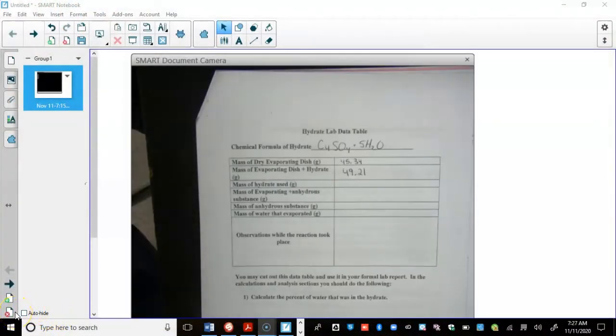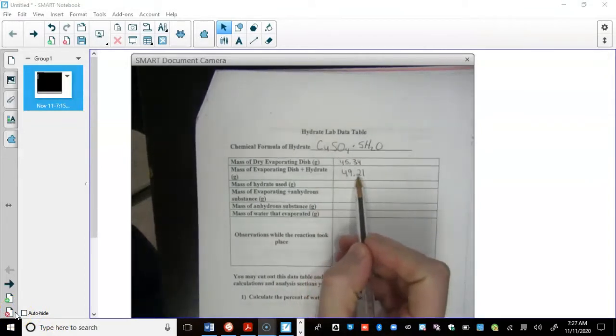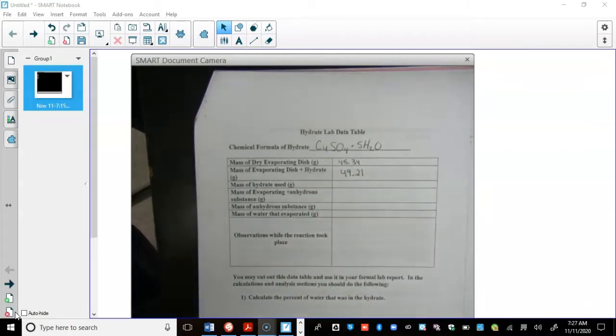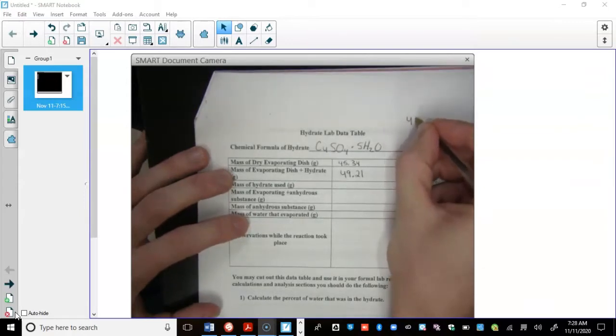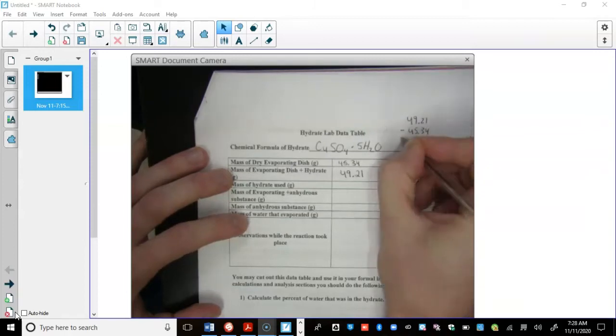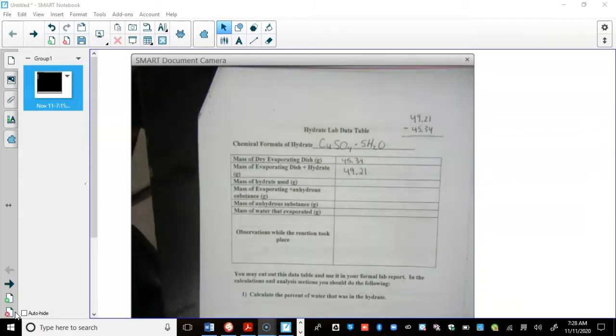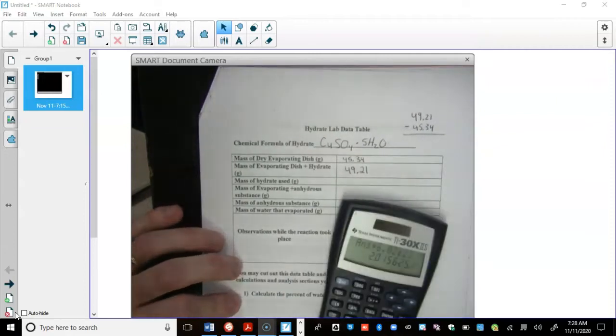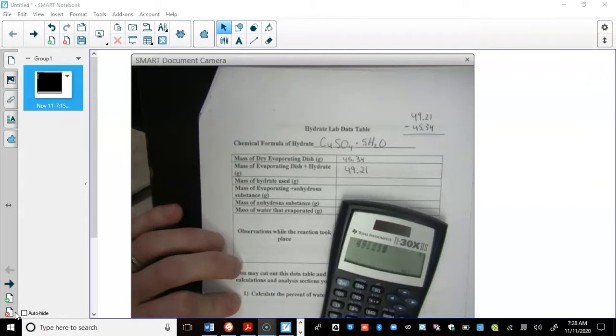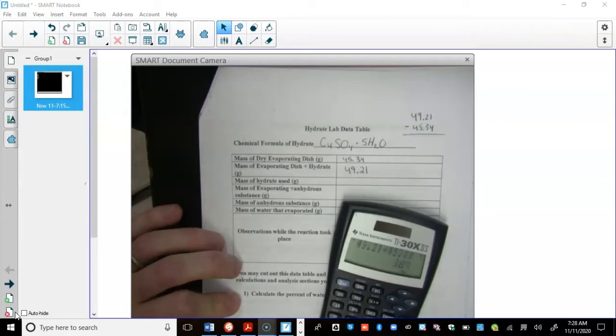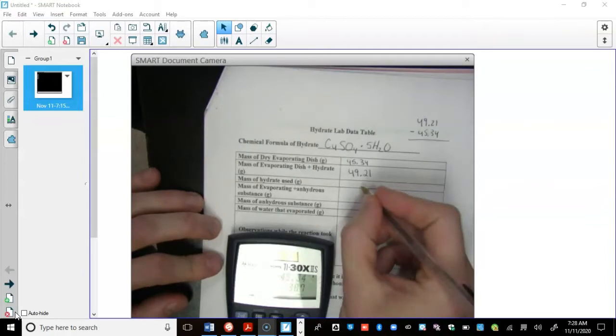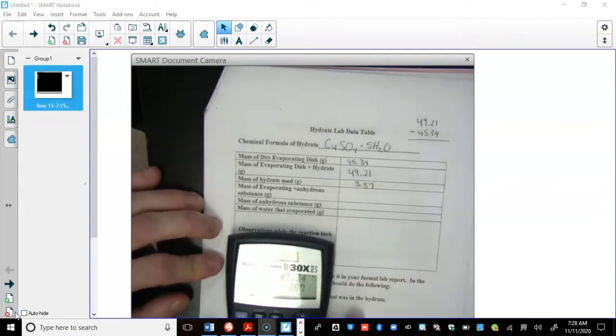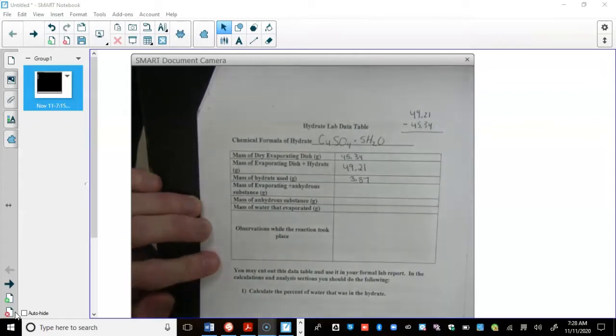All right guys, let's calculate this out. What we have is 49.21 is the mass of dish and hydrate. And then 45.34 is the mass of our dish. What we're going to need to do is take 49.21 minus 45.34. You plug in your calculator. Hey, calculator right here. How convenient. 49.21 minus 45.34. And that's 3.87. It's almost 4 grams. 3.87 grams. That's the mass of the hydrate we are working with. Ready to start heating it up? I am.